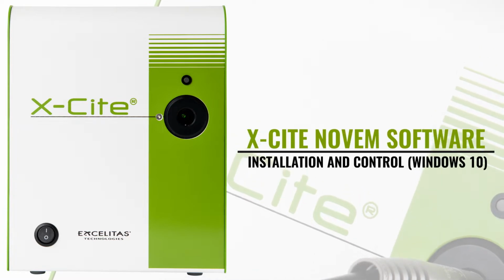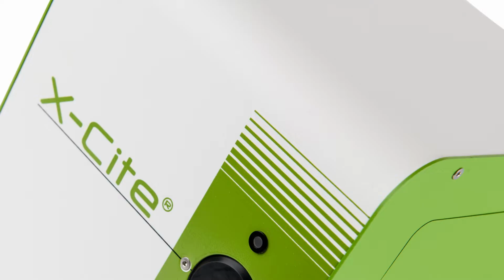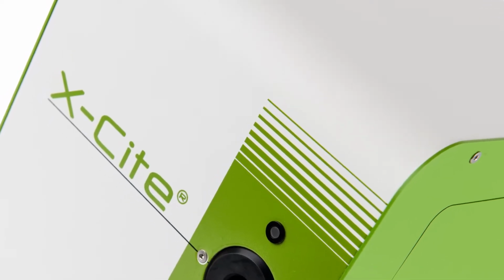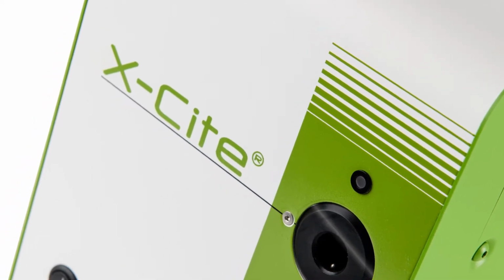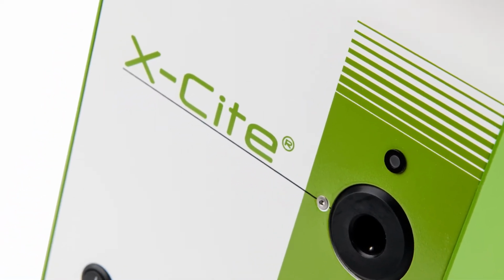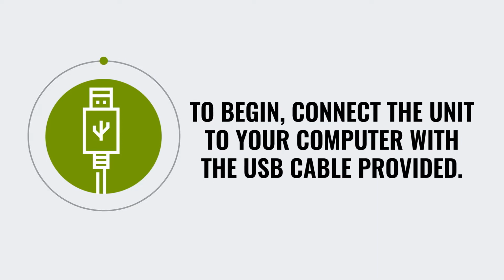X-Cite NOVEM software installation and control, Windows 10. In this video, I will walk you through how to set up your X-Cite NOVEM so you can control the light source through software. To begin, connect the unit to your computer with the USB cable provided.